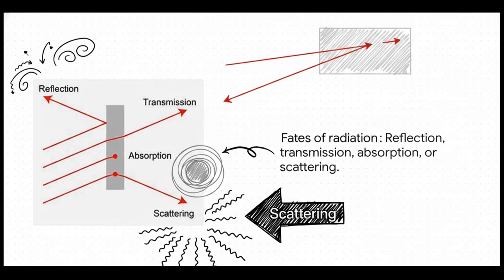And this brilliantly illustrates our starting point. When light hits a sample, it basically has 4 possible fates. It can bounce right off the surface as reflection, transmit straight through it, or get absorbed entirely. But for the rest of this explainer, we are focusing entirely on that bottom path, scattering.